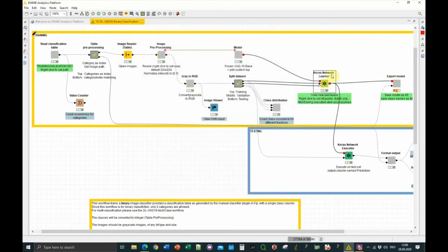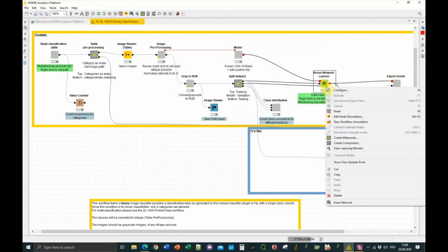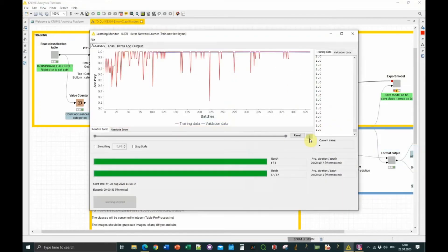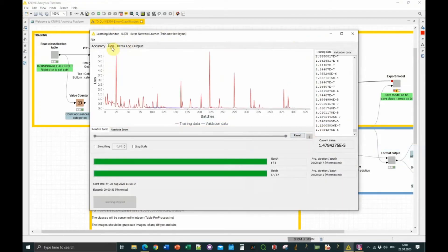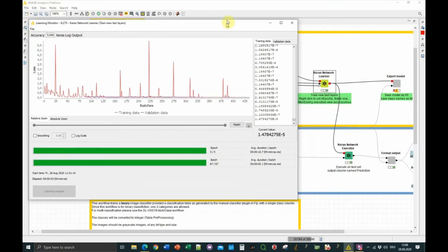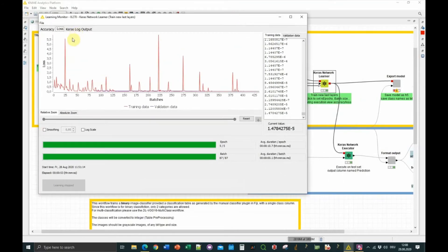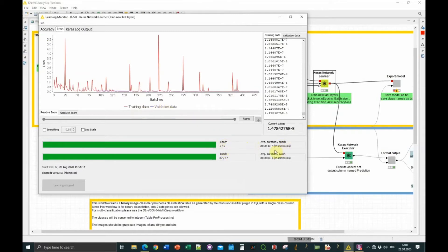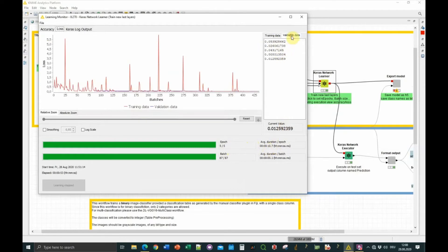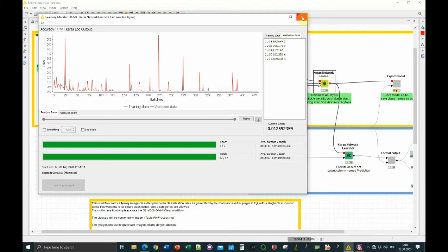In this case, I already ran training once, and I will rerun it with you quickly. But first, I want to show you that we can visualize the progress of the network over time during the training. This is the loss function over time, in red for the training set and blue for the validation fraction, for the five epochs that we have run here, which took just 10 minutes. You can see the error for the training data and for the validation data, which is indeed decreasing, slightly increasing towards the end, but I would say it's sufficient—it's correct values, rather close to zero.